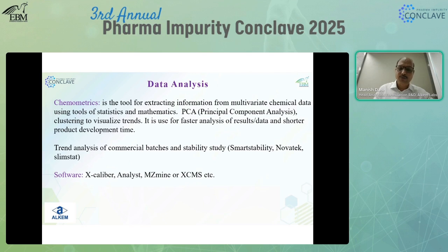Then if we are doing multiple batch manufacturing and analysis during the year or over multiple years, we have to do a proper risk assessment for all the data we have generated so far, and for sending the batches to the market. So the complete data assessment needs to be done as per the quality system to assess the impurity risk. If unknown impurities are coming in these batches, then we have to assess the complete past data as well as extrapolate the upcoming data.